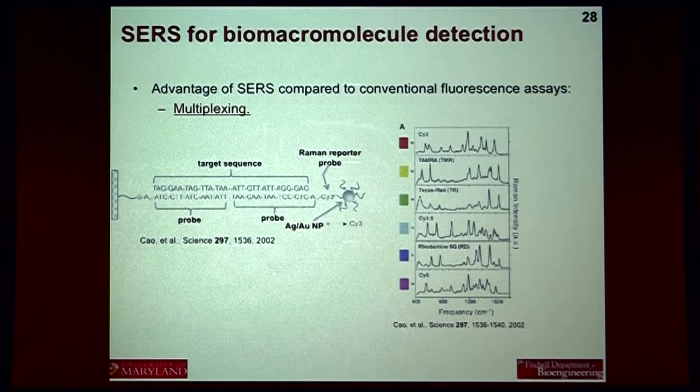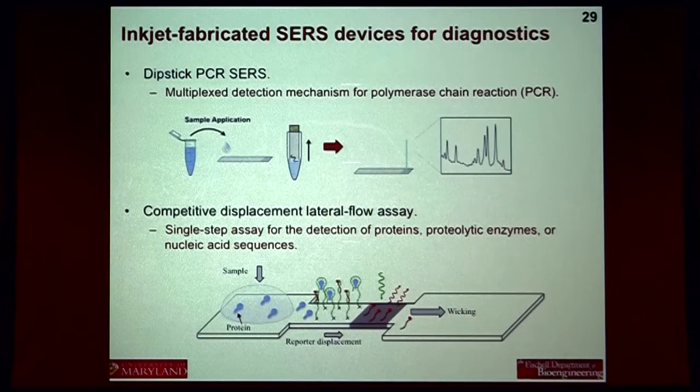So that really suggests that if we want to do a low cost on-site detection where I've just got one spot to look at, I can get, Merkin showed up to six and they hypothesized that they could do a lot more. Other groups have followed up with similar conclusions as well. So the idea is really to get to multiplexing.